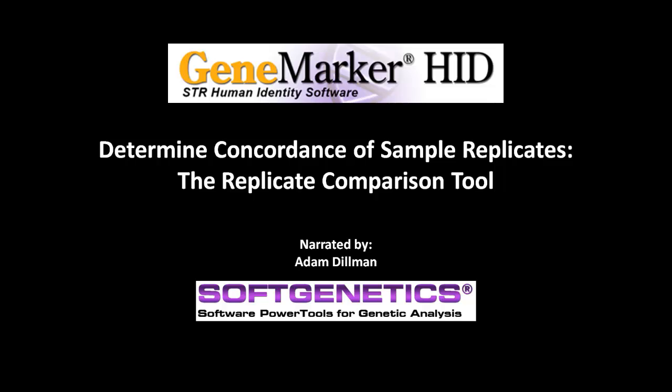My name is Adam Dillman, and today I'm going to be talking about the replicate comparison tool in GeneMarkerHID, which can be used to determine concordance of sample replicates. This is an advanced topic in GeneMarkerHID. To learn more about the basic operation of the program, please see the GeneMarkerHID introductory webinar.